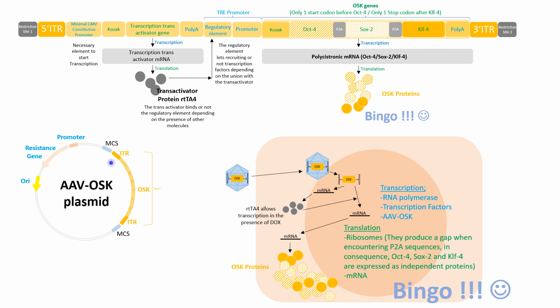We have selected, within the multi-cloning sites that are here, the two restriction sites to clone this information inside the plasmid. What information have we cloned? The following one.